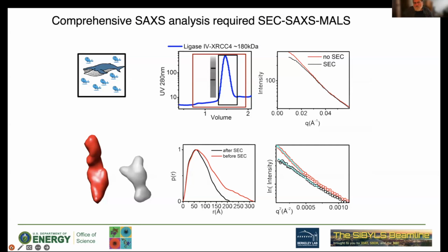That's a good point. That's why I mentioned only when you want to do structure modeling. That means structure modeling of RNA, DNA, protein complexes that have one of these pairs homogeneous characteristic. If you go into aggregates, if you study aggregates or condensates, you potentially can't really do the structures that we showed in the previous talk. There was a perfect example with the copolymers with the RNAs, which are basically aggregates or kind of conglomerates. So that's what batch mode in high throughput is doing.